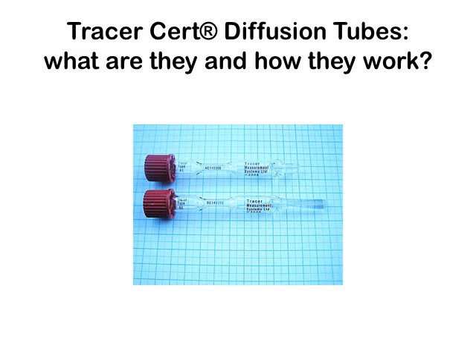The tube is made with a specific length of precision bore glass tubing of a specific internal diameter or bore, which is attached to a two-compartment glass reservoir with a screw thread and cap for sealing. A wide range of nominal internal diameters is offered for these tubes, ranging from 0.1 mm to 4 mm. Diffusion tubes are available with nominal lengths of the precision bore tubing between 2 and 10 cm in steps of 2 cm.